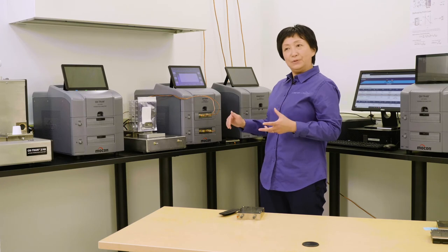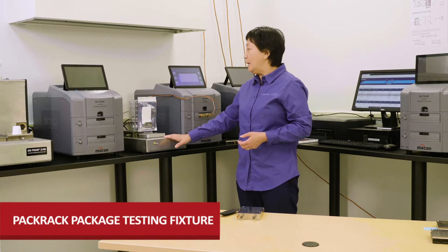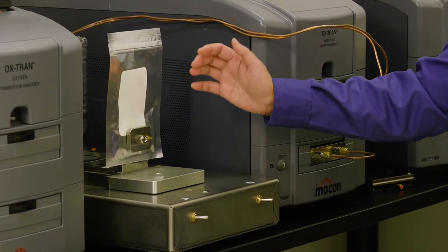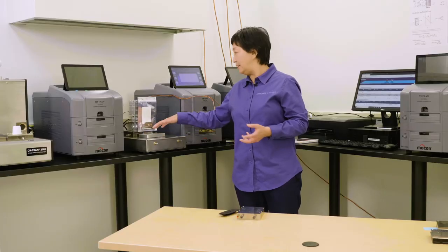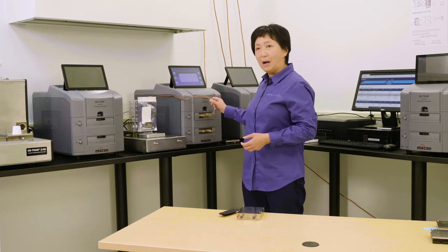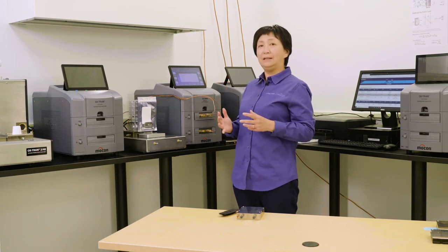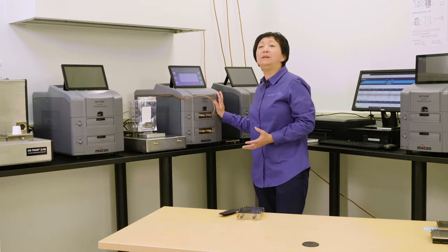Another specially designed fixture is called the pack rack. We have a wide variety of newly designed cartridges for different packages — different kinds of pouches, bottles, and trays can all be placed on this special cartridge. With the pack rack, we connect with copper tubing, enabling a wide variety of package testing. This really extends the capability of this film testing instrument to unlimited applications.